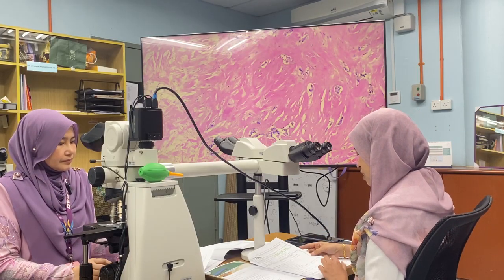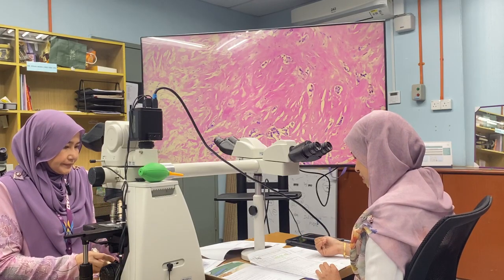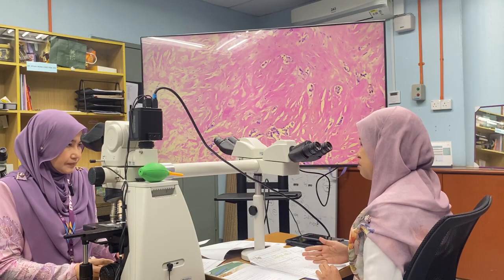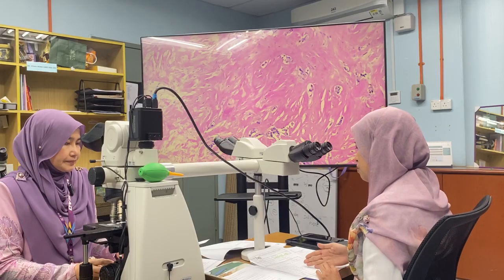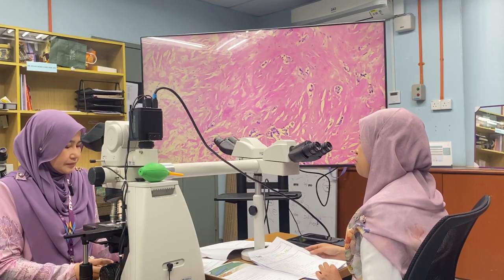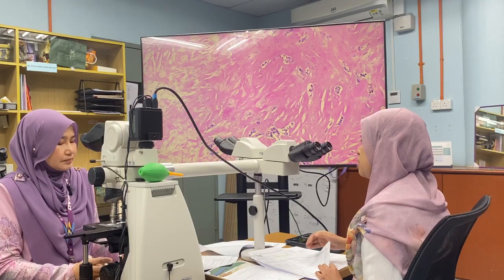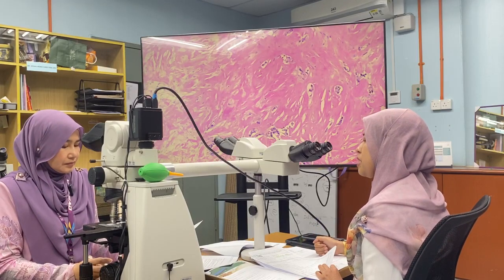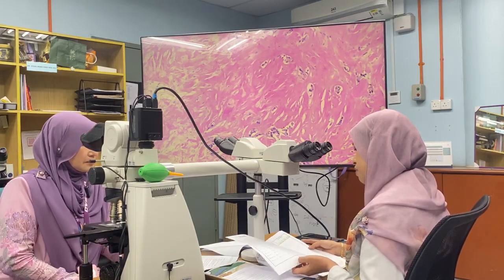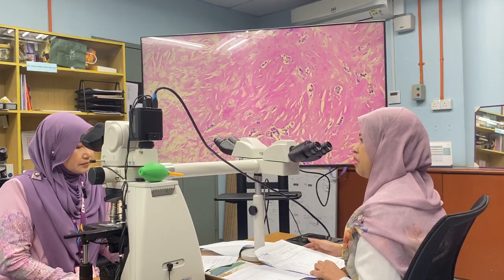So I submitted the breast tissue as follows: superior margin, inferior margin, medial, lateral, with the nearest superficial and deep, and also representative sections from the lesion and the second lesion, and also the nipple areola complex. Otherwise, on the axillary tail there is no lymph node identified, but the specimen is sent with another specimen, which is the axillary lymph node. I identified 9 lymph nodes on the axillary lymph node specimen, measuring 3 to 10 mm, which are all submitted.